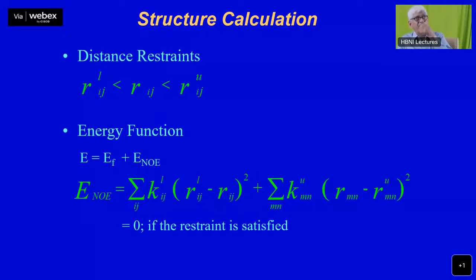You can calculate the approximate distances and say, okay, this particular kind of proton pair has a distance within this particular range, so it has a lower limit and an upper limit. On the basis of the intensity, you define an upper limit, that is here, and a lower limit, which is here. Any model you build, any structure you determine must satisfy these limits. In other words, it should be in between those two limits.